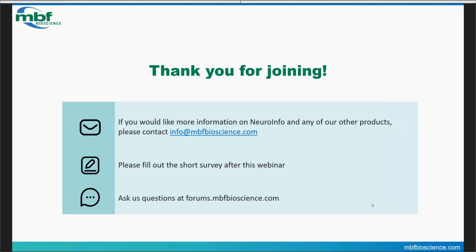The imaging for those brains can take, for each slide, between 2 to 5 hours, depending on how many different fluorophores there are and how bright the fluorophores are. So the imaging is really the slow part of the process. Two of us in the lab can process about 2 to 4 brains per week from start to finish, getting to the image and the registration.